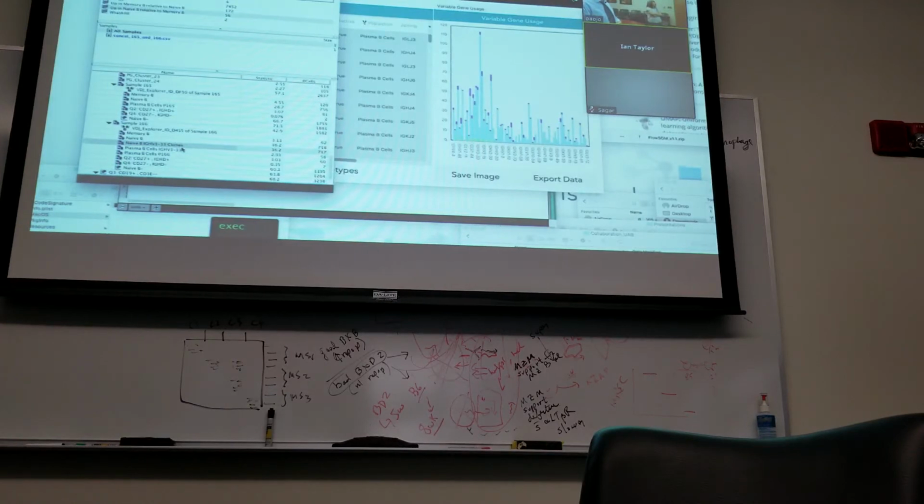All right. So that's it. You're so close, Ian. Well, what I can do is let me clean up these naive B cells that have this IgHV 333 phenotype. I think this is wrong. But besides that, other things I was thinking I wanted to get into was, now that we have, say, clonotypes for plasma B cells, we could compare this between samples 165 and 166.